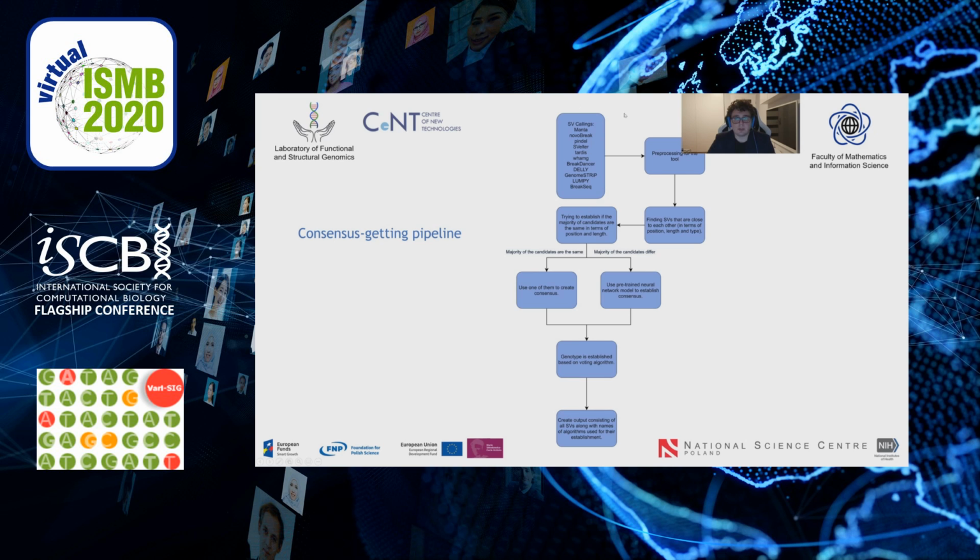As you can see, the input to our tool is in the form of VCF files, VCF outputs actually, from various callers. However, it's not limited to those callers because it's really easy to simply retrain our software to take fewer or more callers.